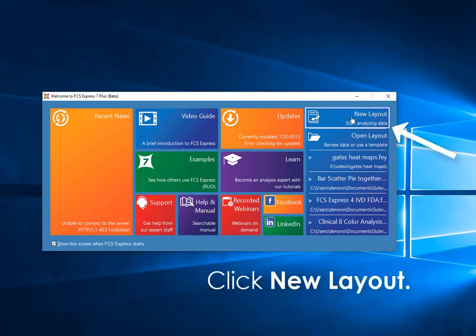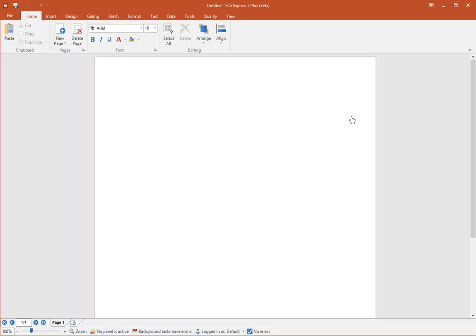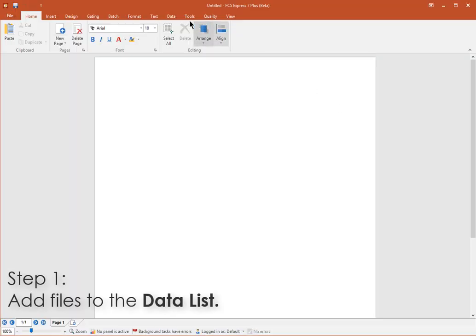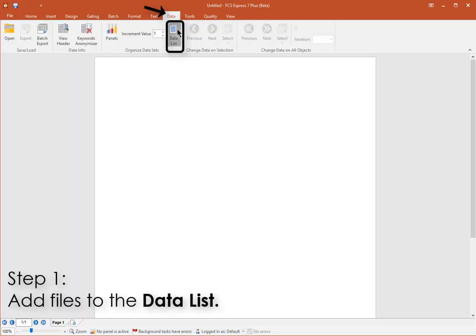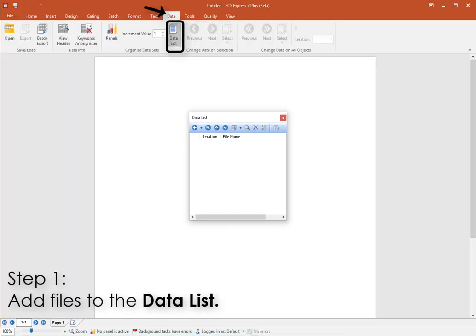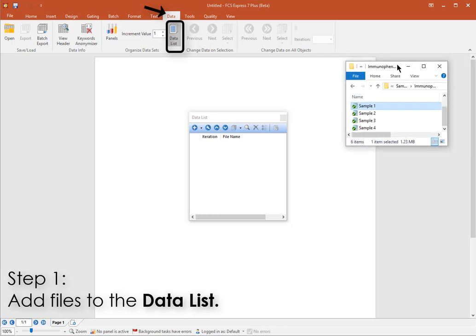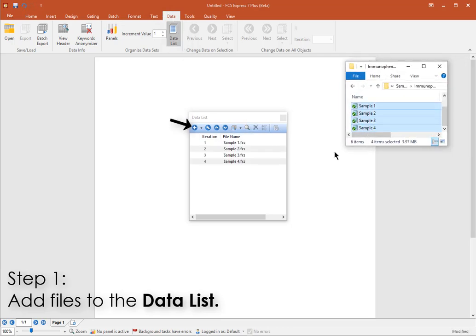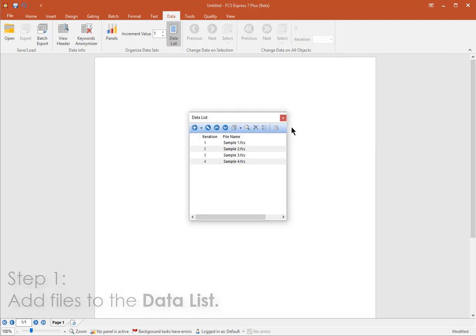From the Startup screen, click New Layout. From the Data tab on the ribbon, open the Data List, and drag the data files you wish to work with into the Data List, or click the blue plus and navigate to them on your computer.